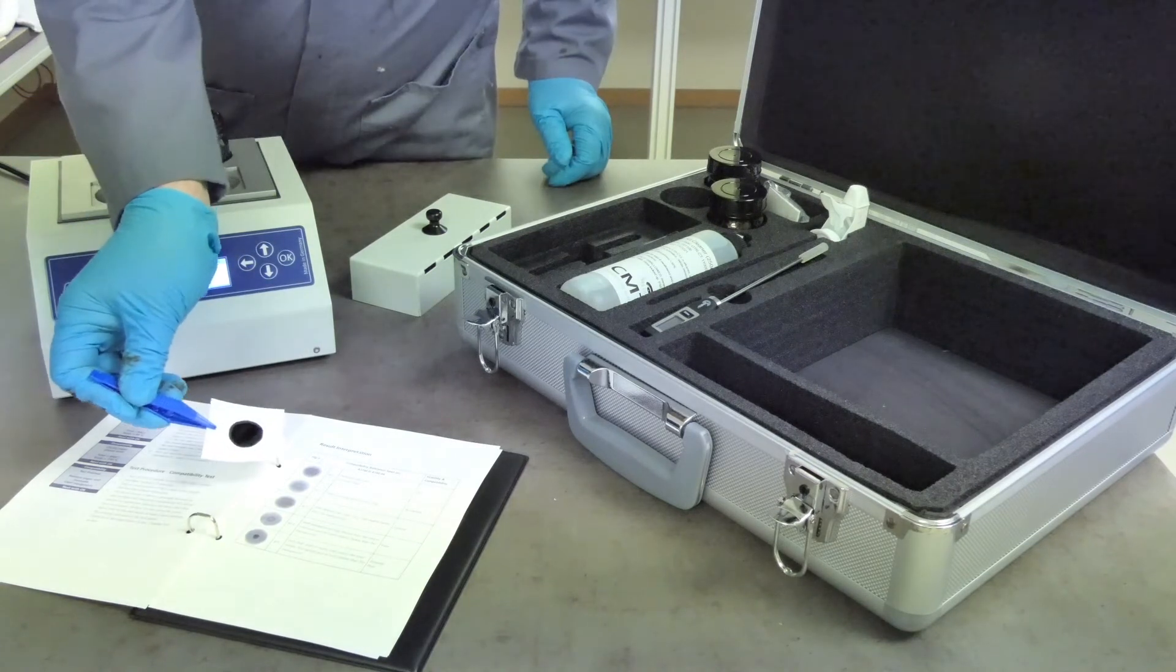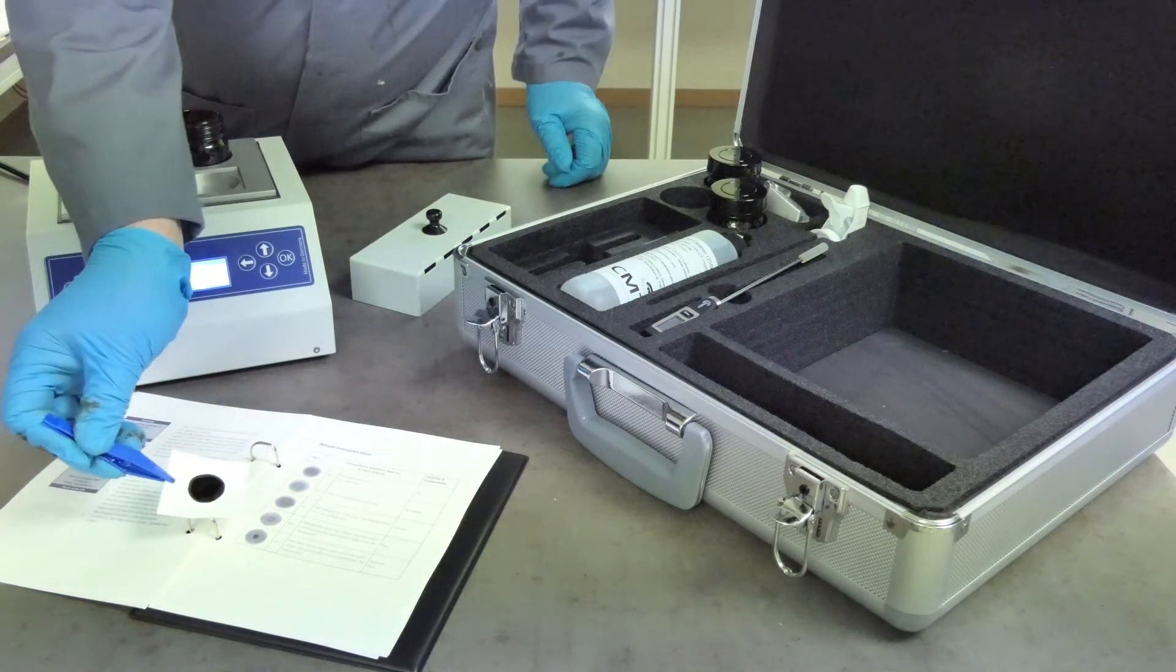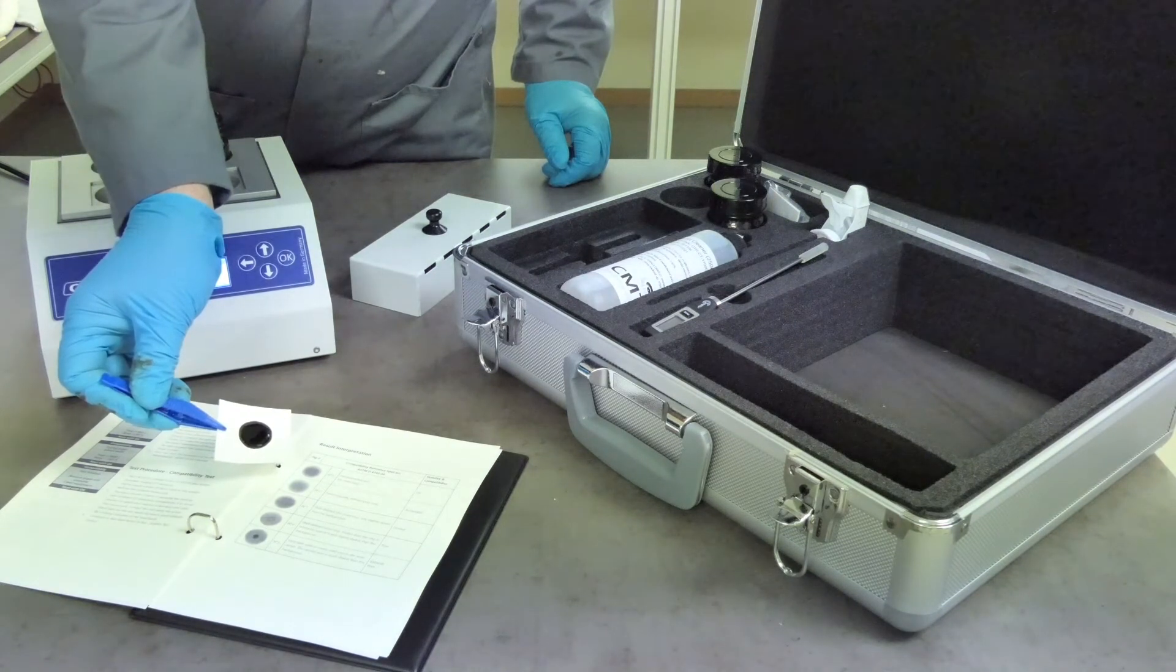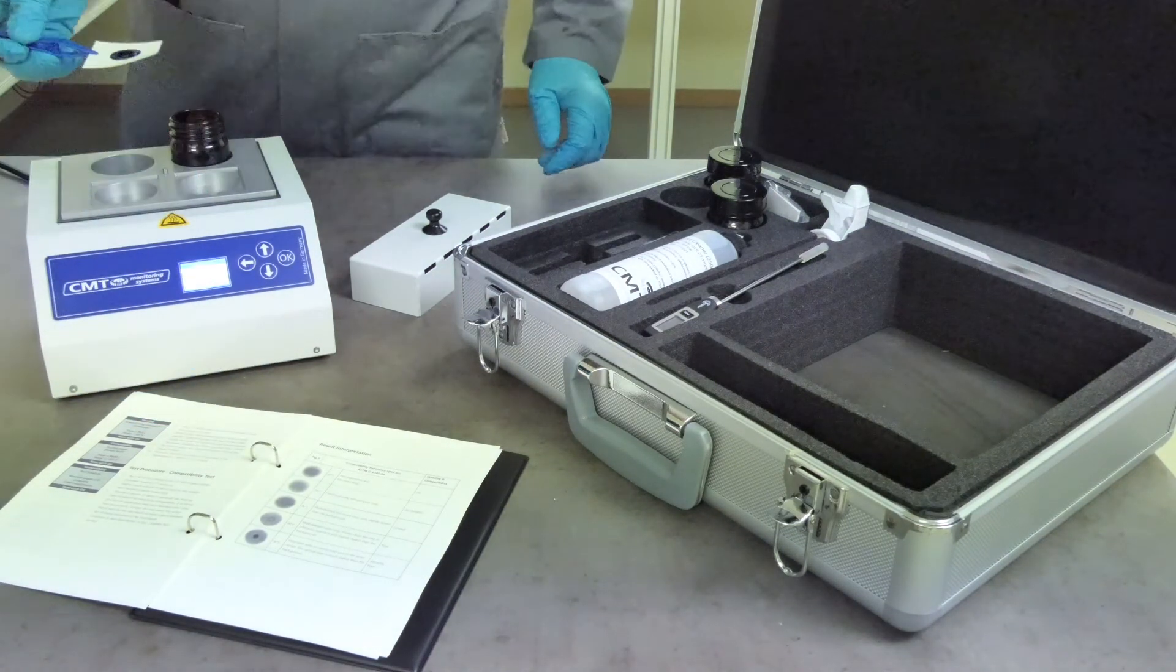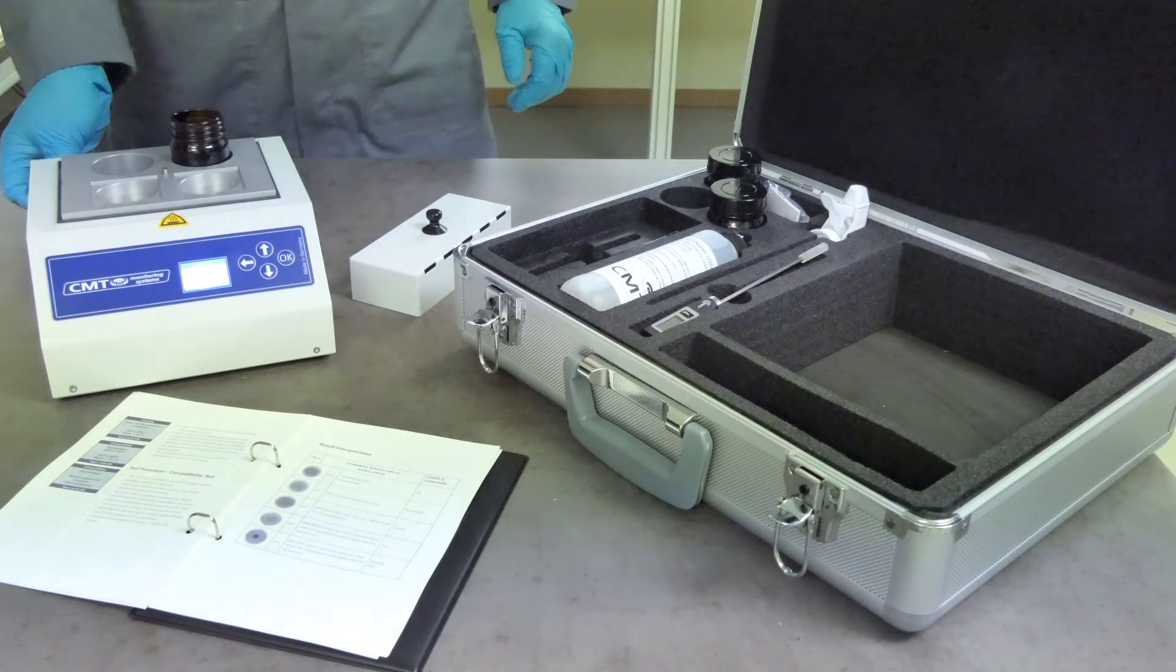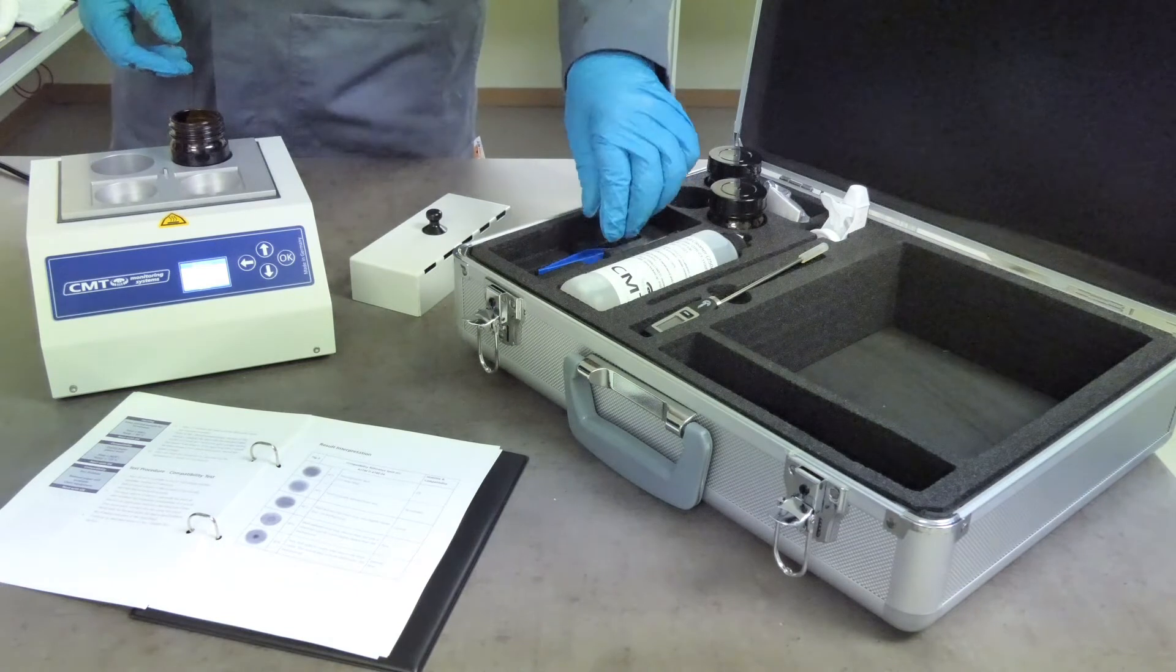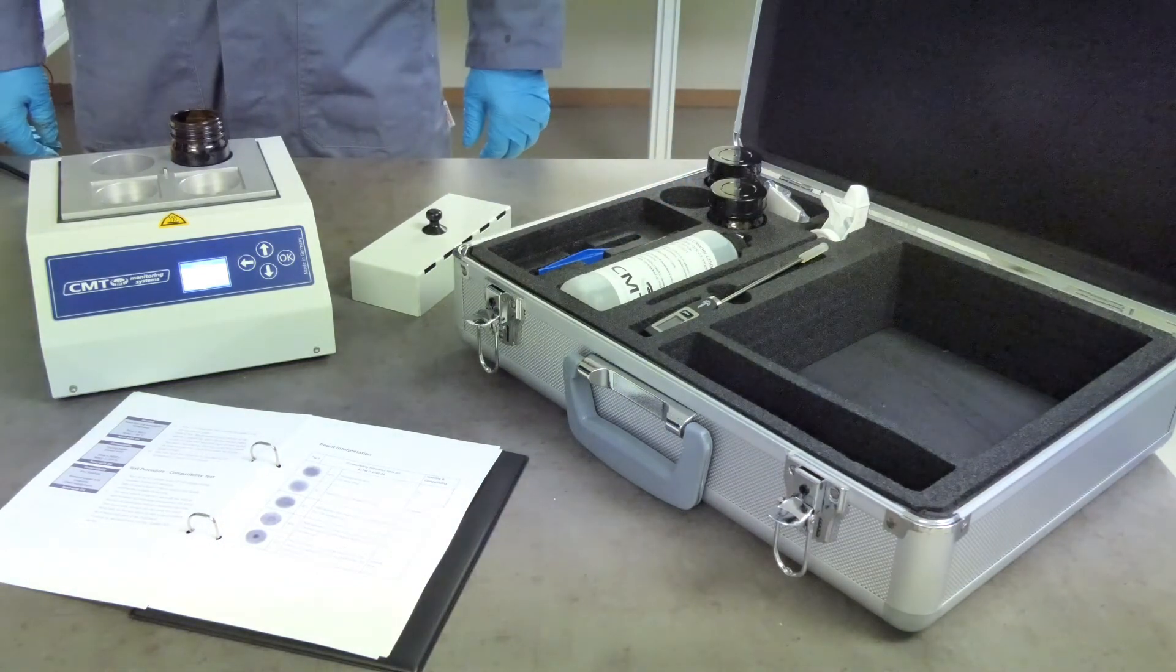Refer to the result interpretation section of the manual. Compare the spot with the standard table and record the spot number having the closest resemblance. If the spot looks like it would be rated between two consecutive spots, record the larger number.